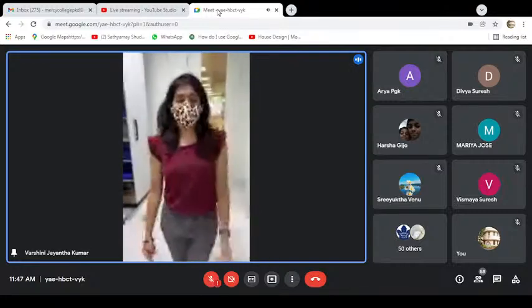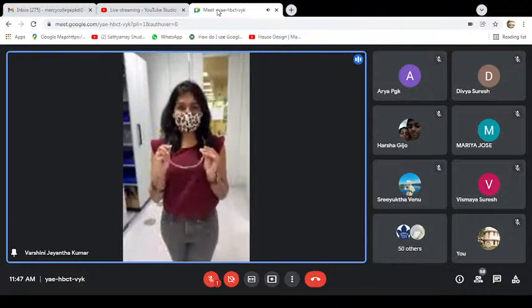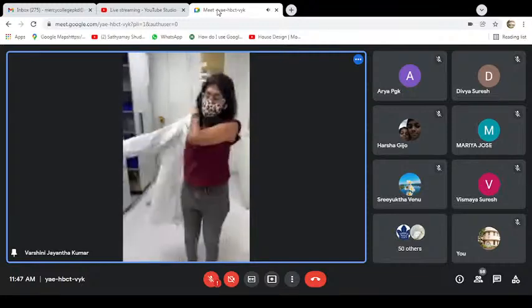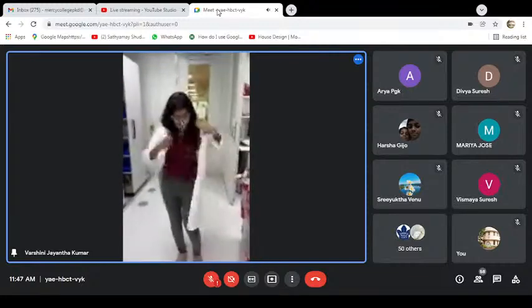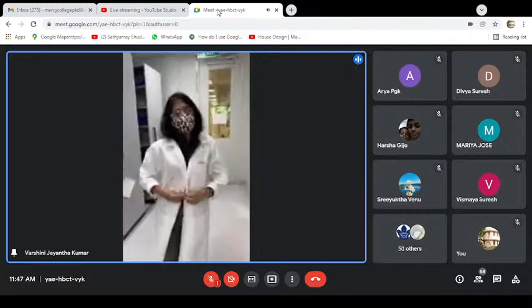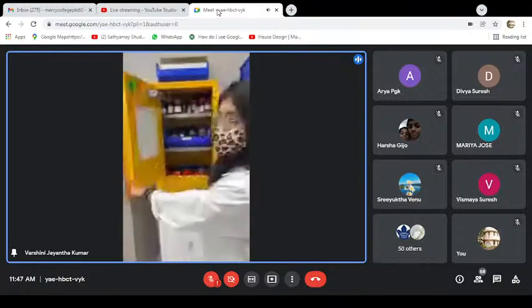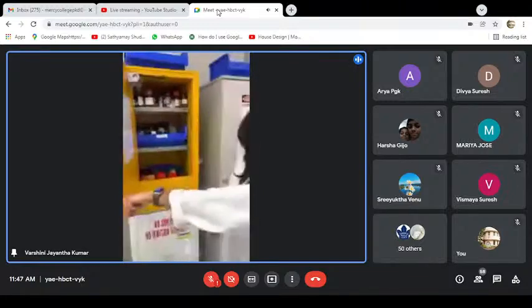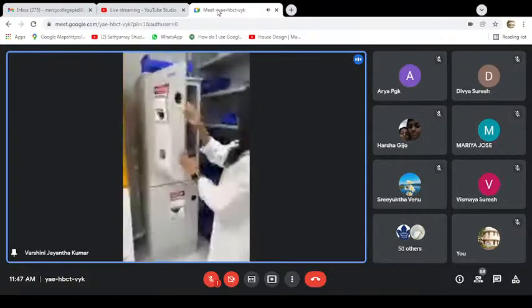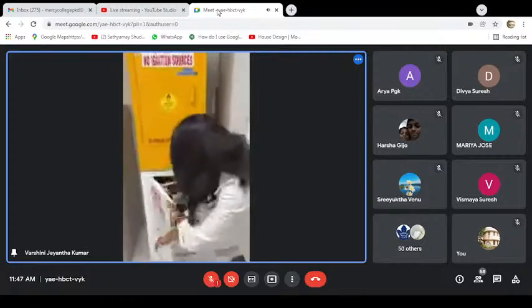Like every chemistry lab, we have our own safety risks. Whenever we enter our lab, we make sure that we wear safety specs and also a lab coat. In our lab, most of the chemicals are stored in safety cabinets like that. Inside the safety cabinets, we have the chemicals, so this reduces the amount of health risk and they are safely stored here. We have bases here, and then we have organic compounds, which are stored over here.